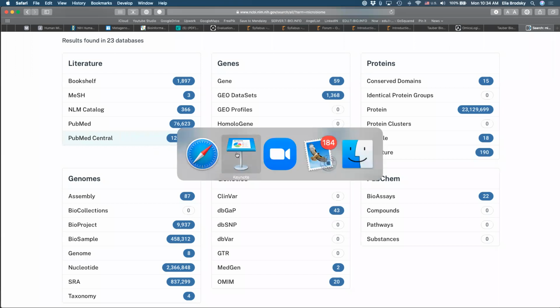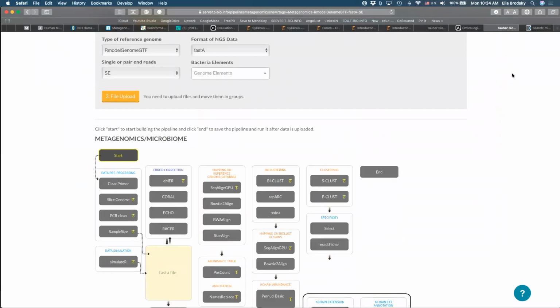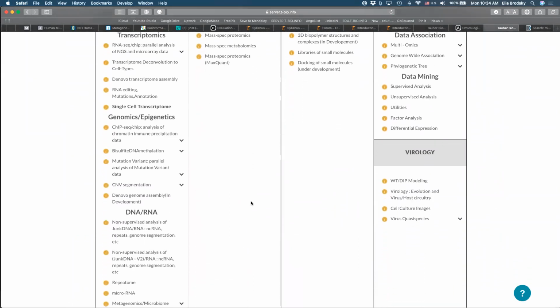Great. Yes, and for Prerna, I will definitely show the results of a pipeline and how to interpret and understand the outputs. That will be the topic of our next session. In our next session, we will start looking at what types of next generation sequencing data sets there are, what types of pipelines you run to analyze them, and what would be the outputs. And obviously for outputs, there will be a variety of different types of outputs, and we will discuss how to interpret the different types of outputs. Okay, Prerna, does that answer your question?